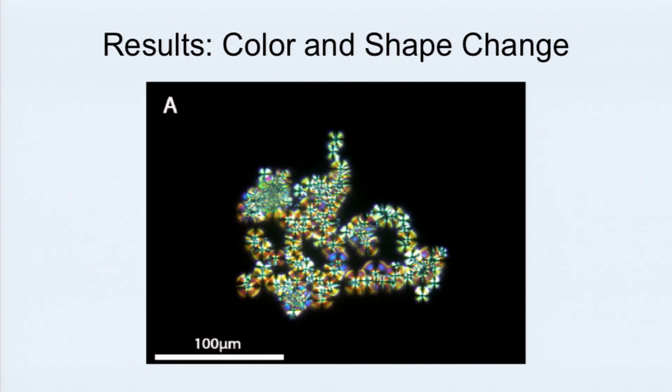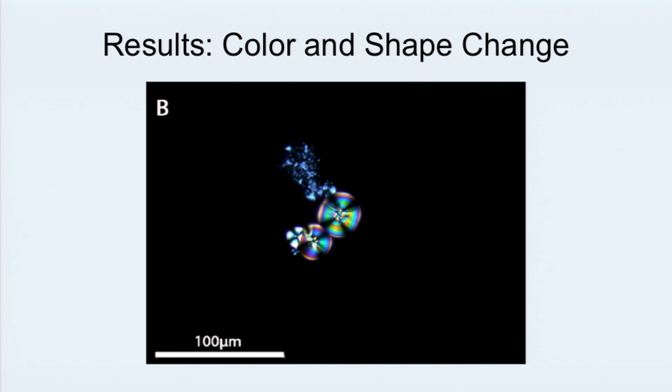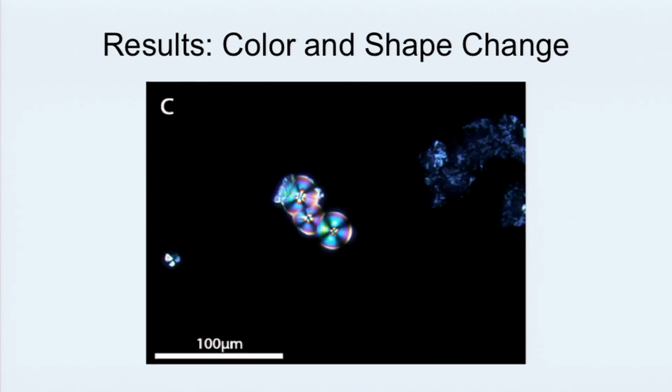What was not expected is what I saw when I looked at my nixtamalized maize starch, or starch that had been in an alkaline solution. The primary change that I saw was a color change. So you can see here lots of yellow and purple, none of that light blue that we expect to see for typical maize starch. So we also see a lot of green, bands of orange, again, rings of purple on the outside, and some more light blue.